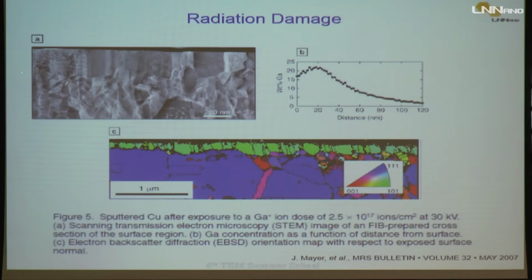Here, it's very difficult to see, but you can see an interface that is about 200 nanometers, which is very clear in this experiment. This is an EBSD image of the same material. You can see the dimension is also about 200 nanometers.